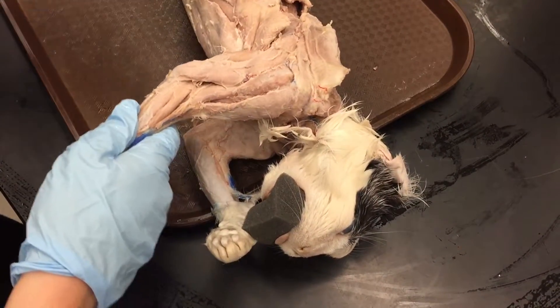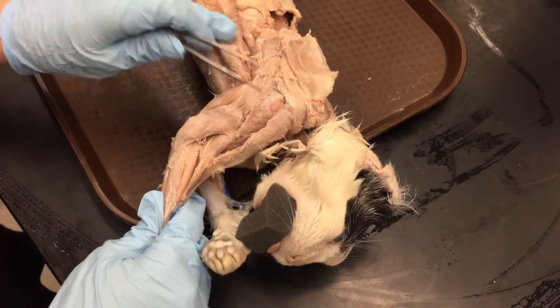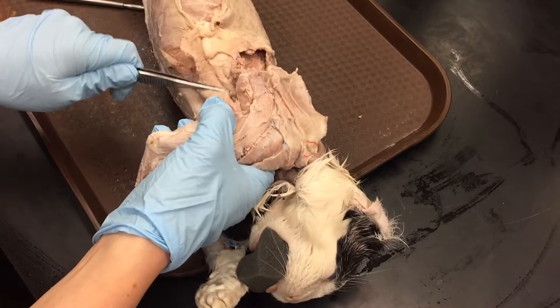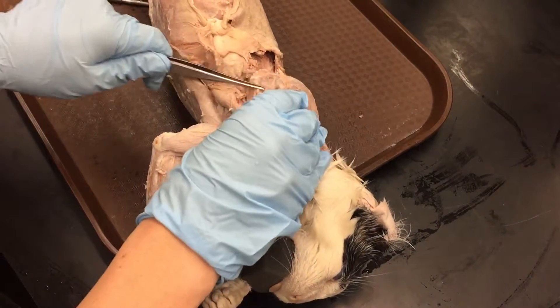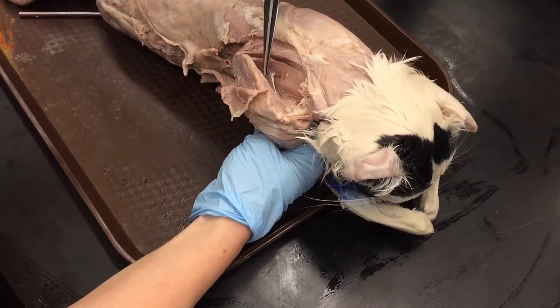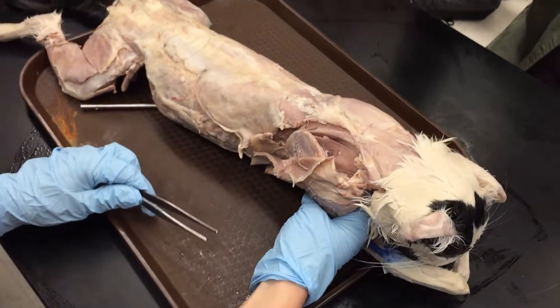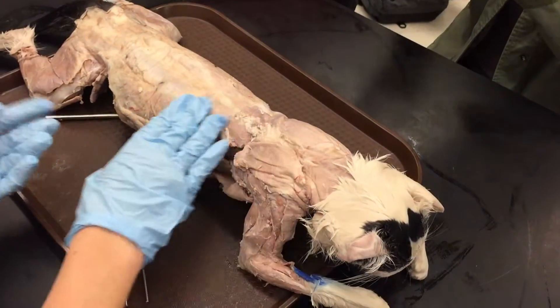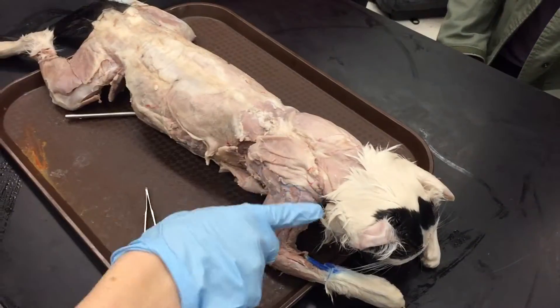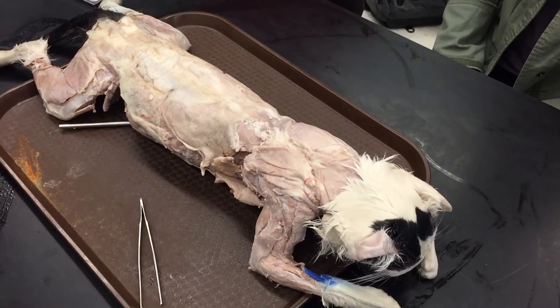Epitrochlearis. Clavodeltoid. Acromiodeltoid. Spinodeltoid — parallel to the spine. Teres major. Infraspinatus. Supraspinatus. And then finally, does anyone remember inside? Subscapularis. That's it. So the best way to memorize these is to come up with acronyms — like C-A-S for the deltoids. The triceps are pretty straightforward.